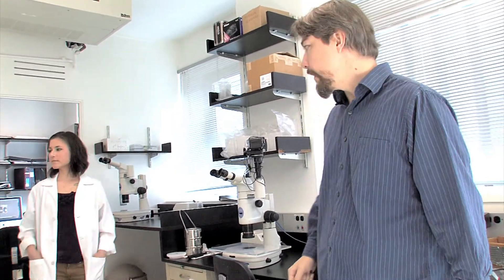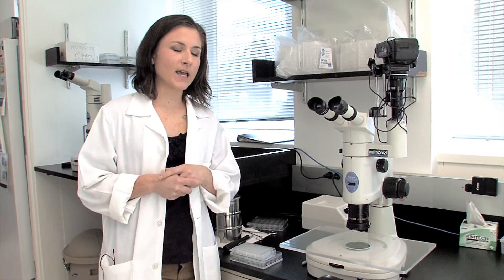Okay, so this is our room where we do our crystallization experiments, and Amanda is a graduate student in the lab, and she's going to tell you what we do here. After we have purified protein, the next stage of the process is to try to coax it into growing crystals. And crystals are an ordered structure of protein molecules.